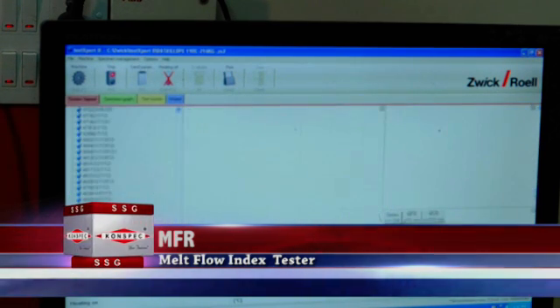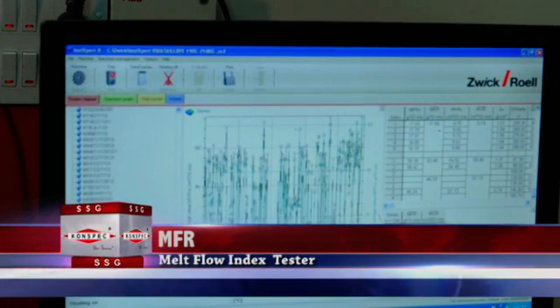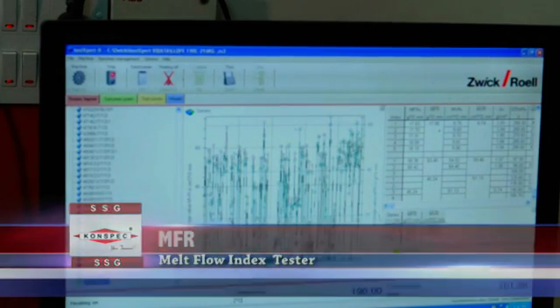Melt flow index tester is used to determine melt mass flow rate (MFR), melt volume flow rate (MVR), and melt density of thermoplastic resin.